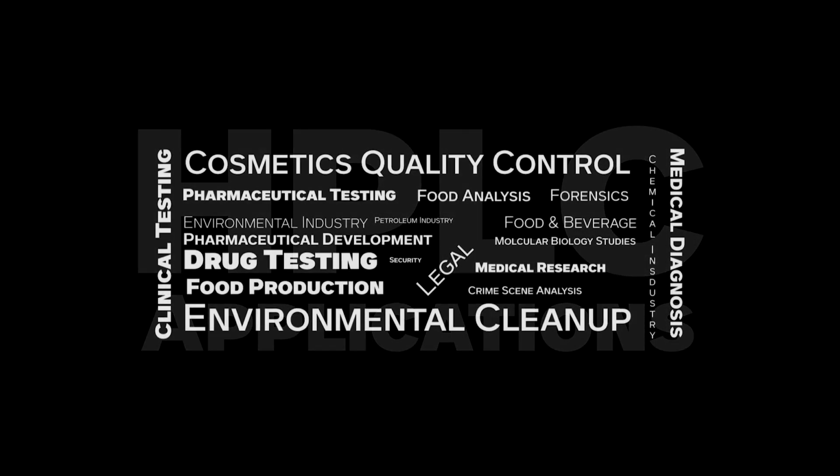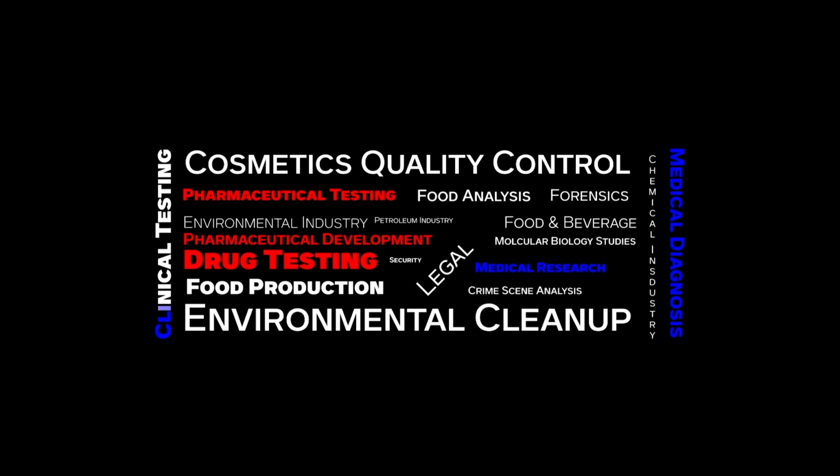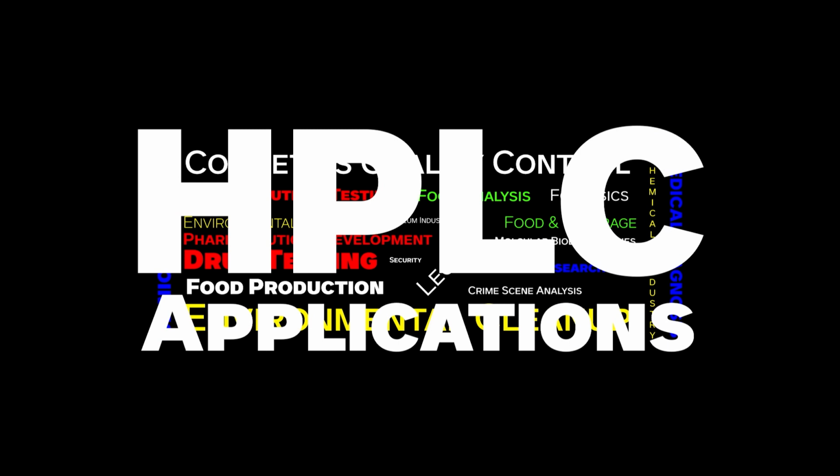It is widely used in various fields, including in pharmaceutical development, pharmaceutical testing, and drug testing, in medical research, medical diagnosis, and clinical testing, in the food and beverage industry for food analysis, and in the chemical and environmental industries during environmental cleanups. In this series of videos, we will explore the fundamentals of HPLC, including its principles, components, instrumentation, and applications. First, let's take a look at some applications of HPLC.